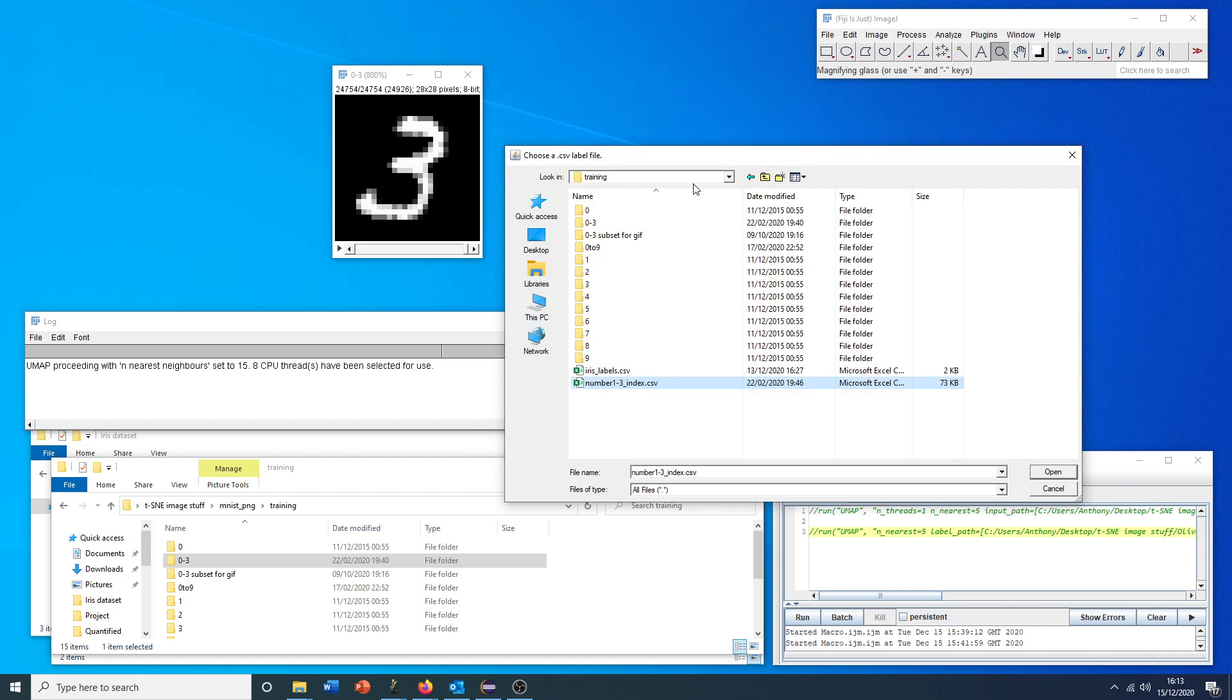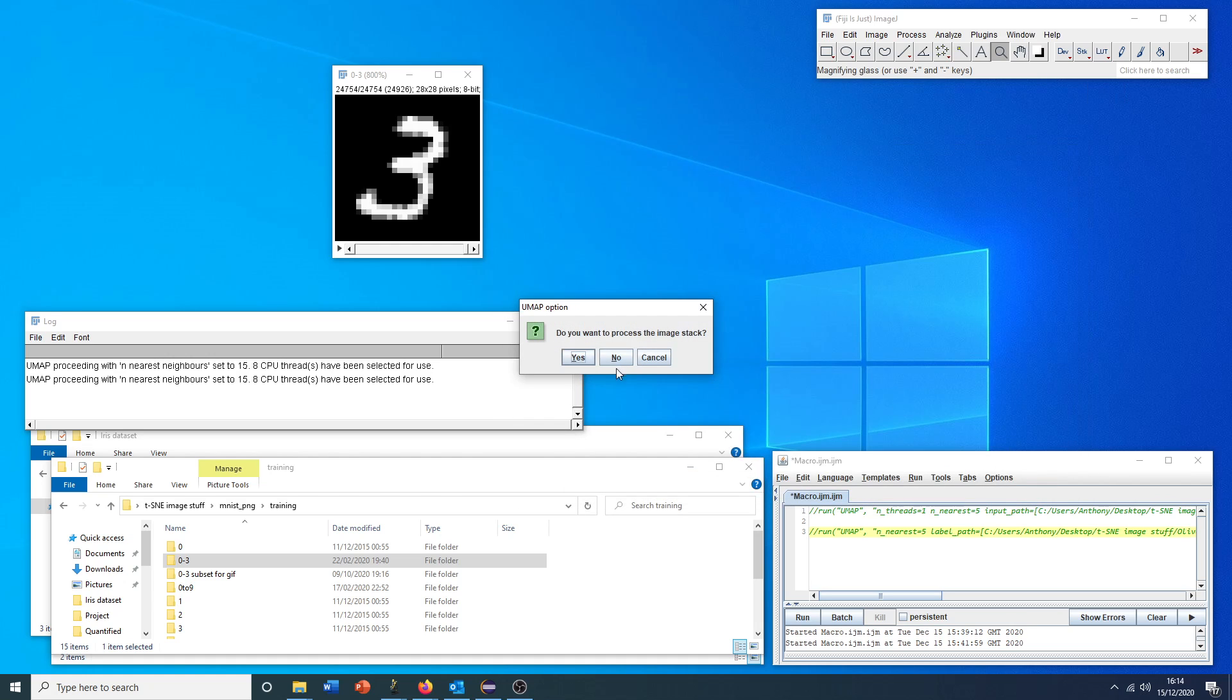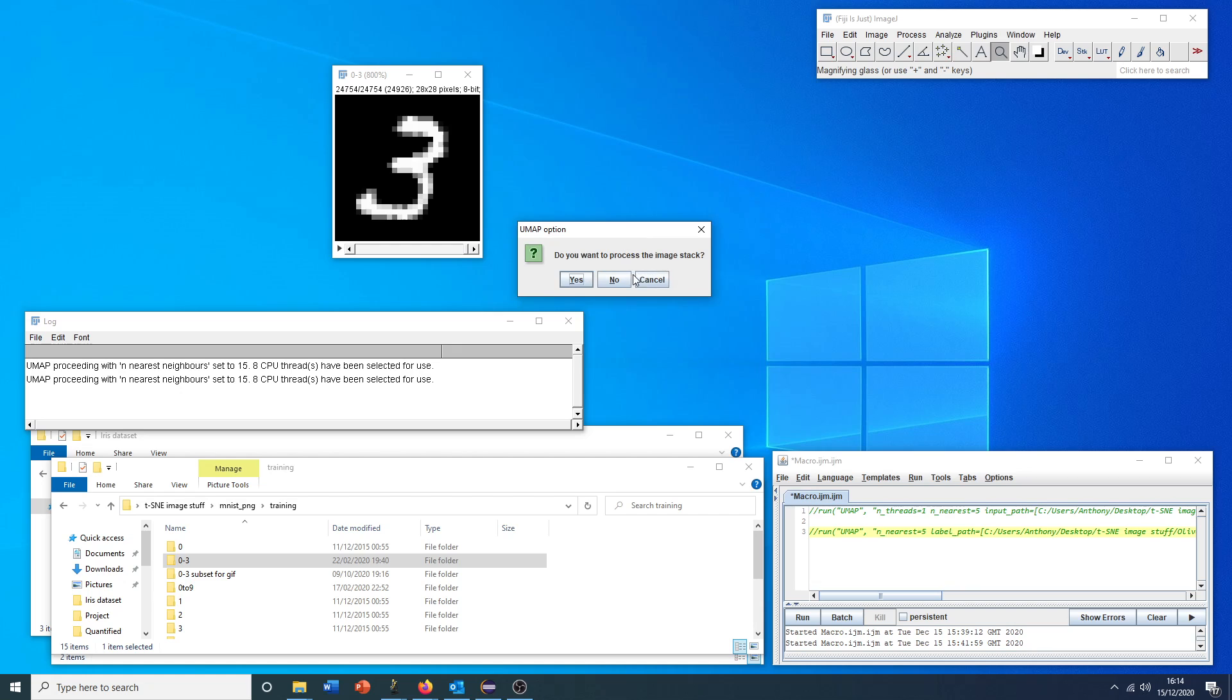The most important thing is that the order of all these labels is the same as the order of the original data, either in the folder or the image stack. We don't need that opening. We can just select this file and click open.